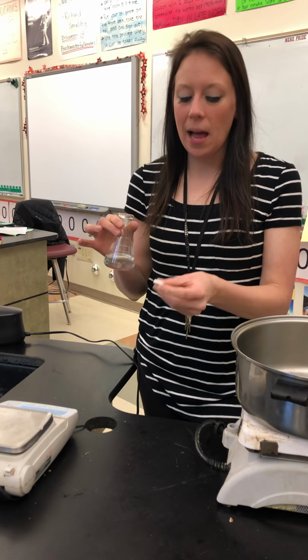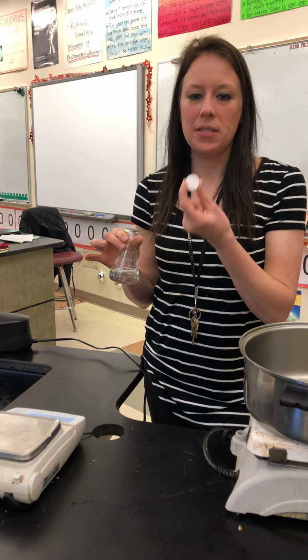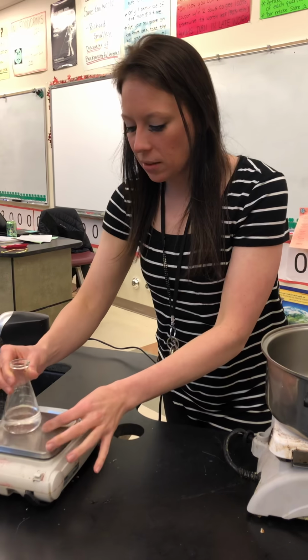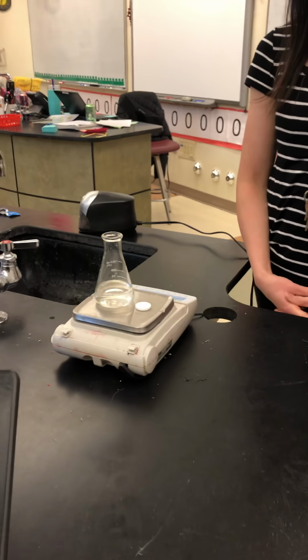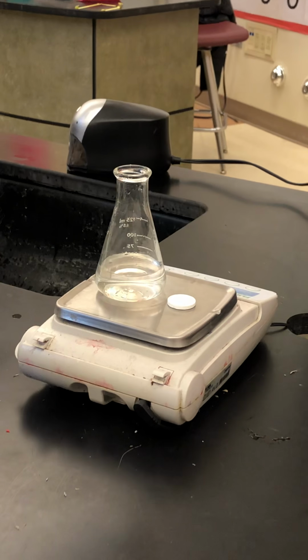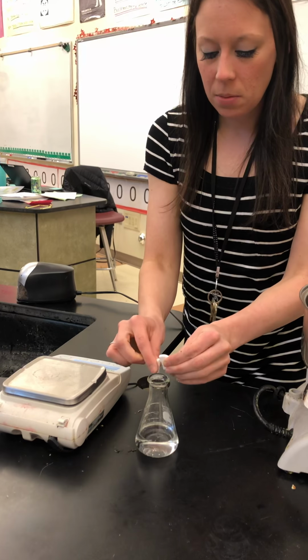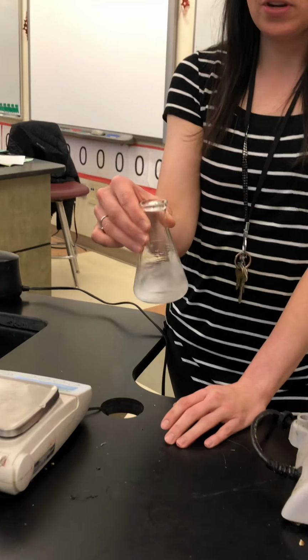So for the Alka-Seltzer Lab, what we're doing is we know that there's 1 gram of citric acid with some excess reactants, and we know that carbon dioxide is produced. And so the first thing in the lab that we did was we put the flask with the water that we're going to dissolve the Alka-Seltzer in on the scale, and in the absent student data, it says it weighs about 100 grams.